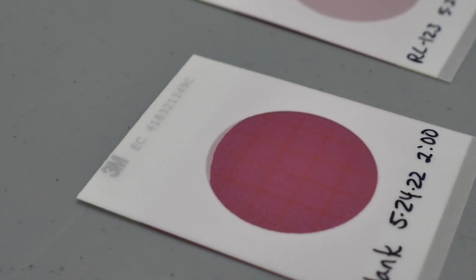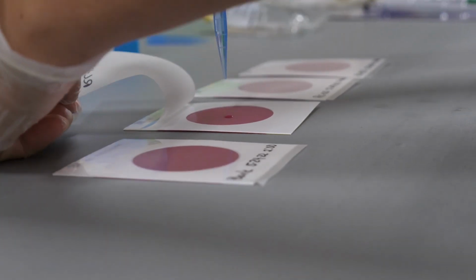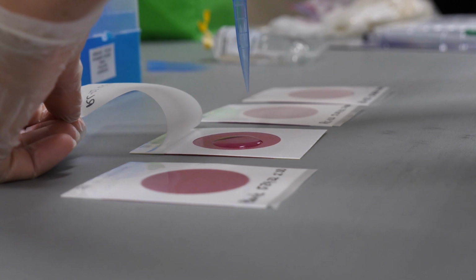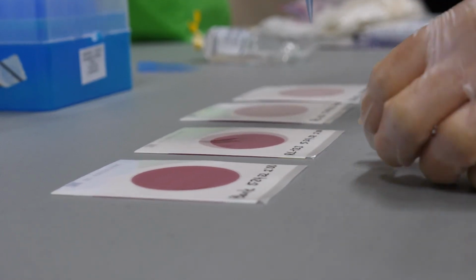Slowly replace the film so no air bubbles are trapped. If air bubbles are present, discard that plate and start a new one. The water should spread out to cover the entire pink circular area of the plate. You can slightly tilt the plate to distribute the water evenly. However, if water spills out the side, you must discard the plate and start a new one.